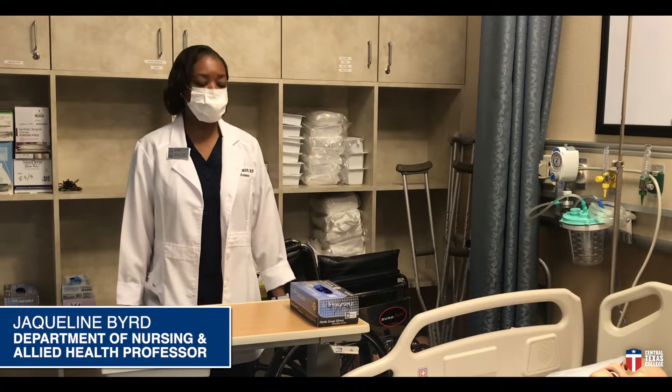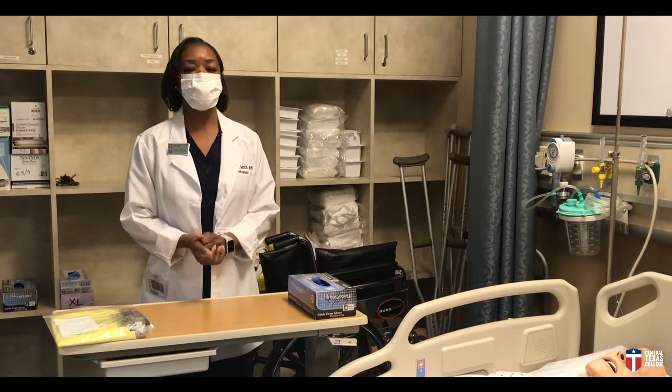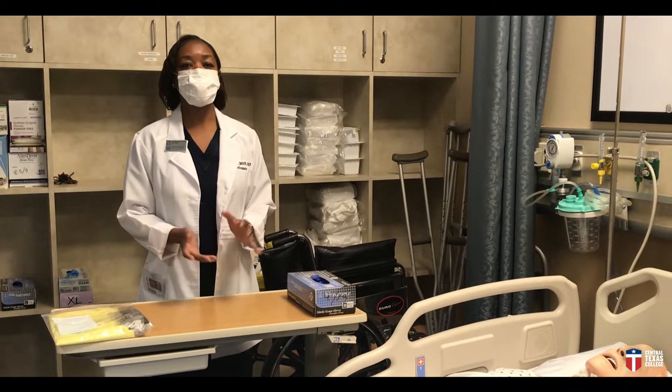Hi, I'm Jacqueline Bird. I'm a nursing faculty at Central Texas College, and today I'm going to show you how to properly put on and remove your clean gloves.